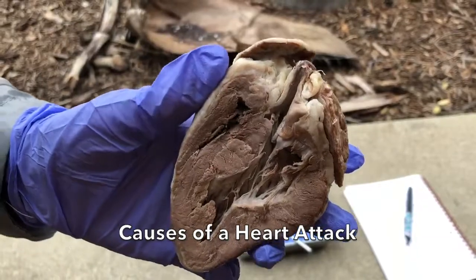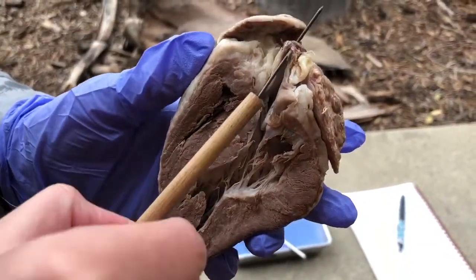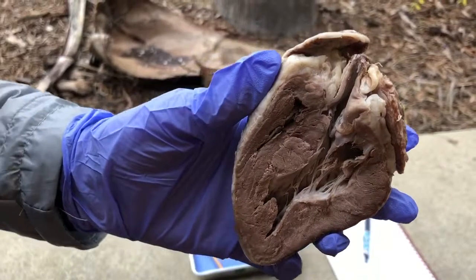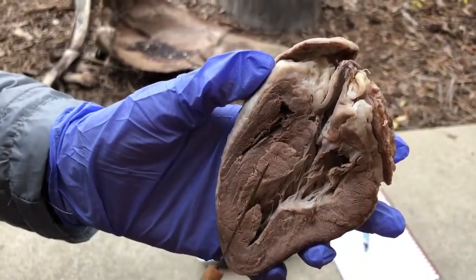So here I have the posterior side of the heart, and a heart attack is caused when the coronary arteries that branch off of the aorta here are blocked by a buildup of adipose fat, which prevents blood from properly circulating throughout the heart.